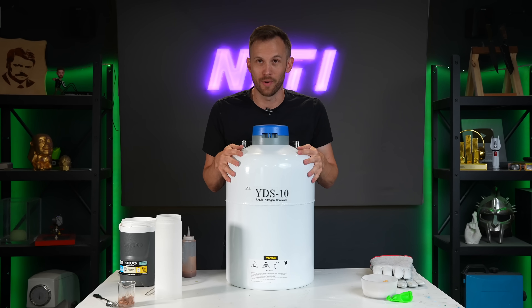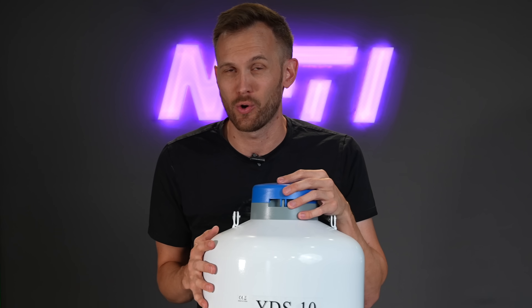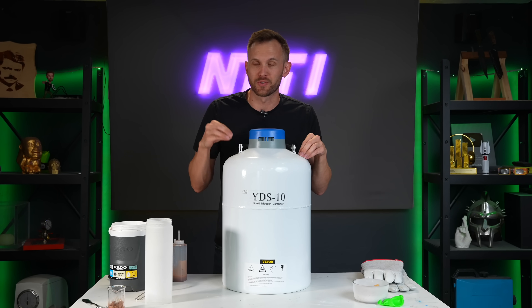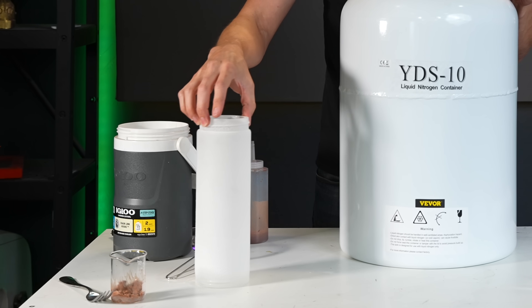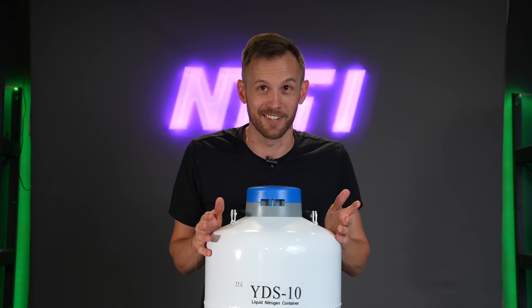So what is going on inside the liquid nitrogen dewar to make sure it stays cold? This whole container actually only holds 10 liters of liquid nitrogen, yet it's way bigger than a 10-liter container. I want to see what's really happening inside. Is it something like styrofoam walls like a cooler? Is it something more like the vacuum walls of a thermos, or maybe some combination of the two? The only way to really know is to open it up — and I don't mean just taking off the lid.